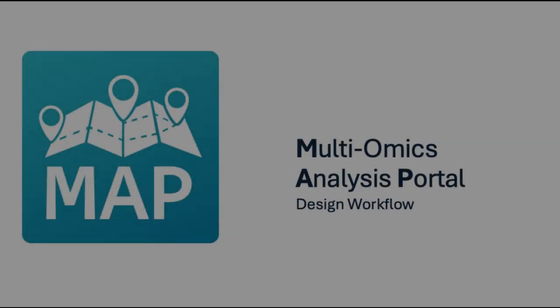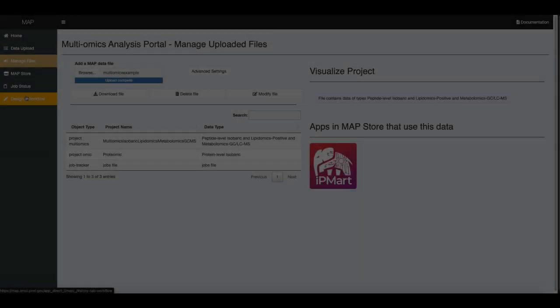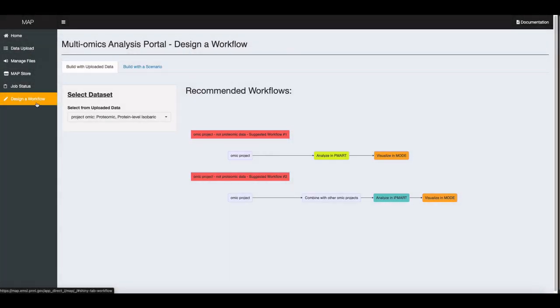In this video, we will discuss the Design a Workflow tab. This tab is primarily used to guide the user through linking applications together to build a workflow for specific analyses. The first tab under Design a Workflow will show different workflows based on the current data uploaded.